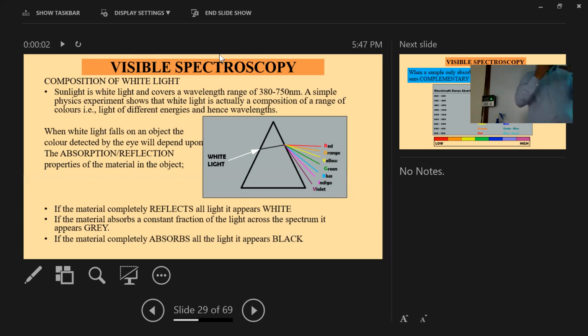And then you may have the question, why are we getting one after another? Any of you have the idea? That is very simple. It means it is bending somehow. It should go like this way. If we put the white light like this way, it should go like that way. But it is bending somewhere. How much it will bend will depend on the wavelength.